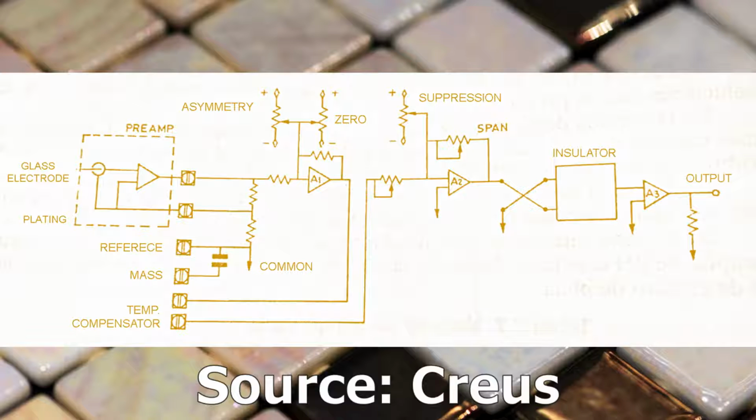Although the mechanism that allows the glass electrode to measure the hydrogen ion concentration is not exactly known, it is established that when the electrode is introduced into the liquid, a potential directly related to the hydrogen ion concentration of the liquid is developed. That is, if this concentration is greater than that inside of the electrode, there is a positive potential across the electrode tip, and if it is less, the potential is negative. This potential changes with temperature. For example, it goes from 54.2 millivolts at 0 Celsius to 74 millivolts at 100 Celsius per pH unit.